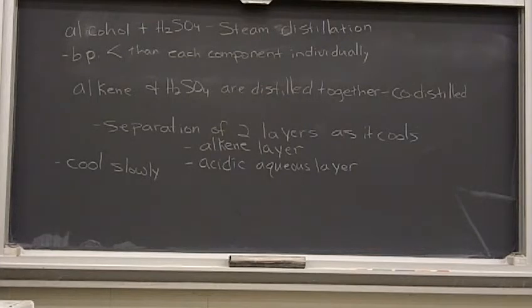So you'll drain your aqueous layer. Then you're going to wash that organic layer with sodium bicarbonate, and you use 10 milliliters. You don't need very much because you've got a really small layer. And then you're going to go on and dry that organic layer with magnesium sulfate. But remember, you don't have a lot of volume, and so you don't want to use a lot of magnesium sulfate, okay?